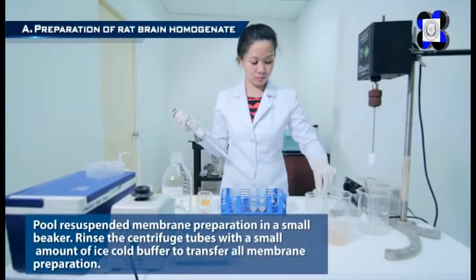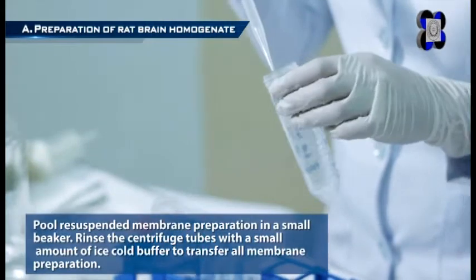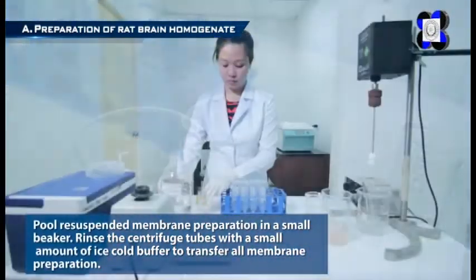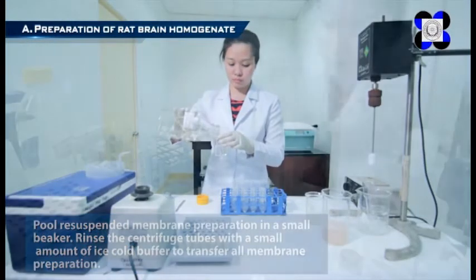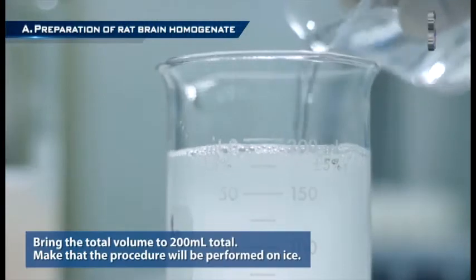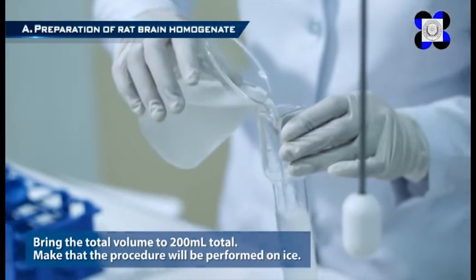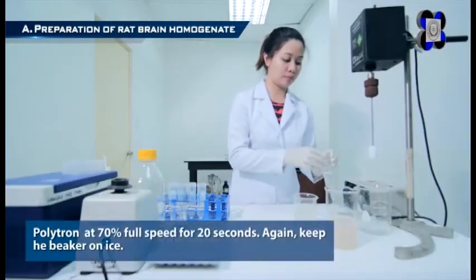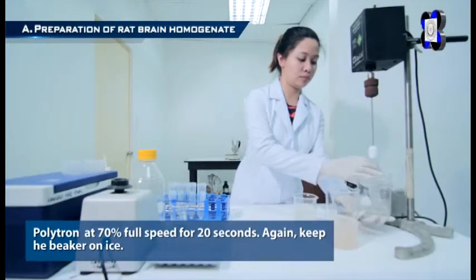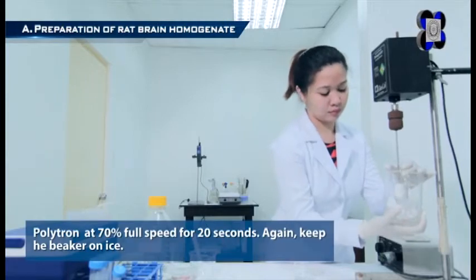Pool the resuspended membrane preparation in a small beaker. Rinse the centrifuge tubes with a small amount of ice-cold buffer to transfer all membrane preparation. Bring the total volume to 200 milliliters total, making sure the procedure is performed on ice. Polytron at 70% full speed for 20 seconds, keeping the beaker on ice.